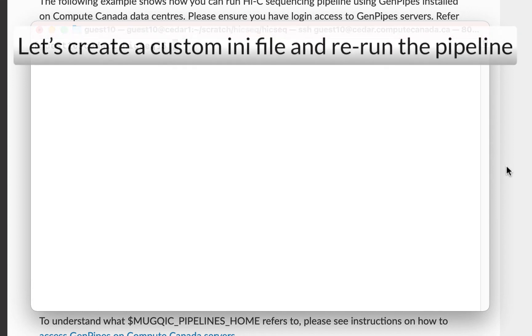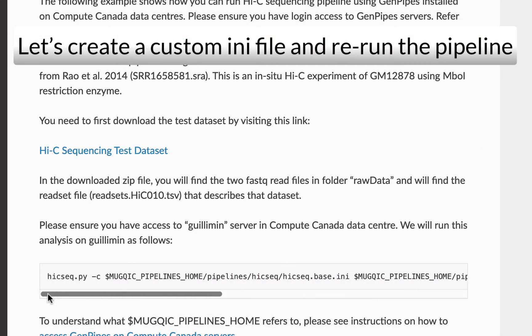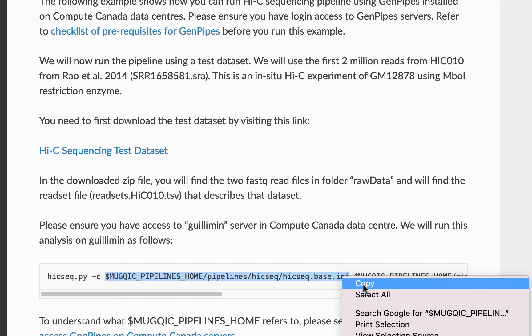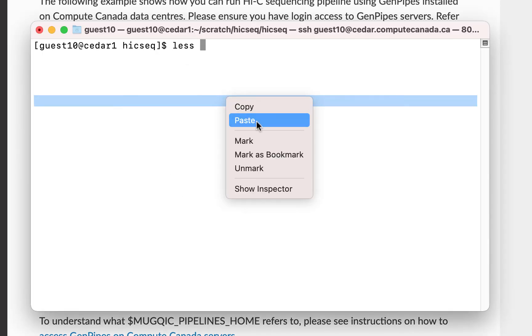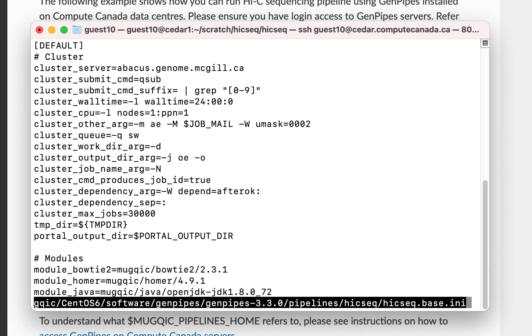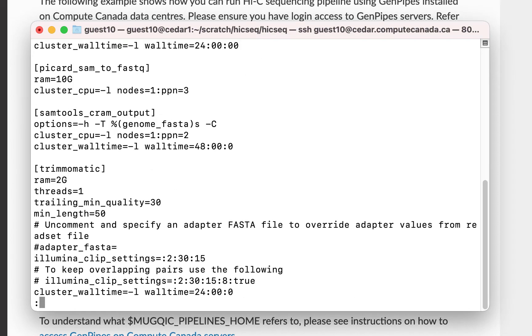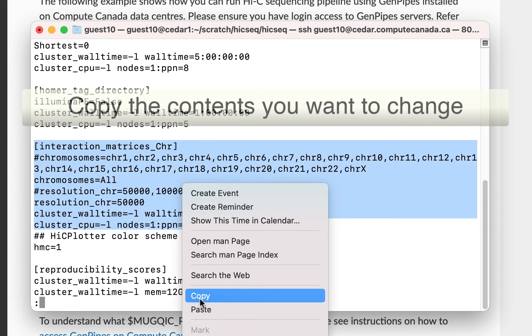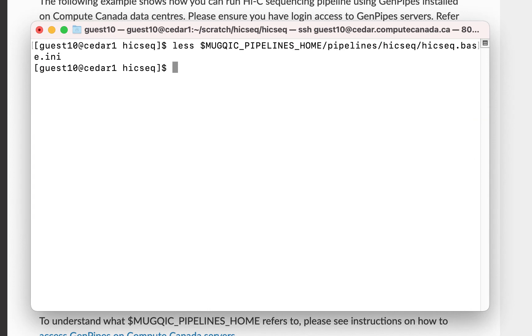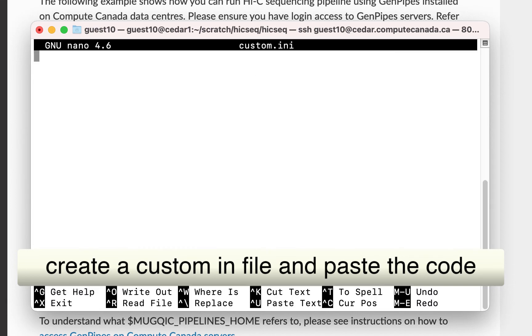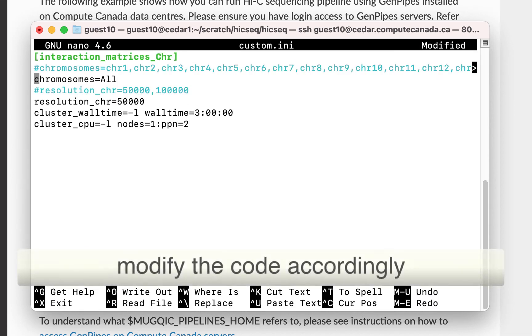Now, let's create a custom .ini file and rerun the pipeline. Here, I am changing the parameters of one of the steps in the pipeline. For that, you can copy the contents in the .ini file. Then, create a custom .ini file and paste the code you just copied. Now, modify the parameters you want to change, save the file and exit.